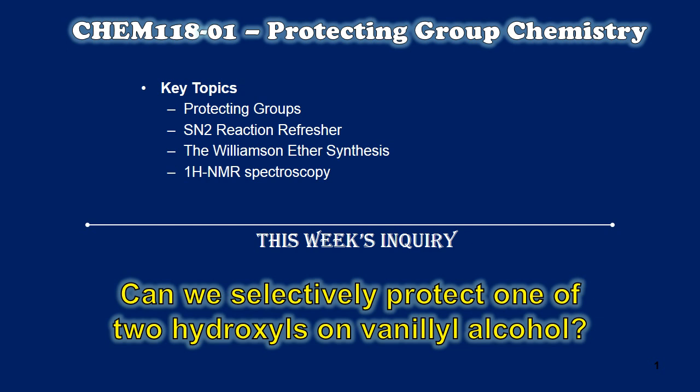Welcome to the Fundamentals Lecture for CHEM118 Experiment 1. This week we'll be exploring protecting group chemistry. So we'll start by discussing a generic example of exactly what a protecting group is and how it works.